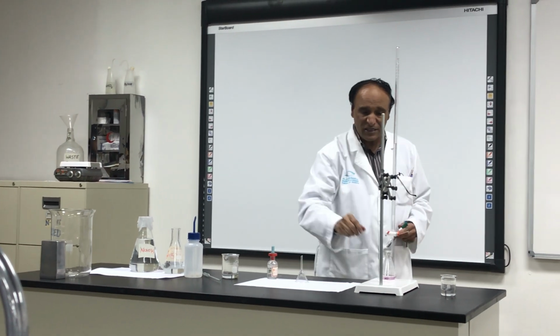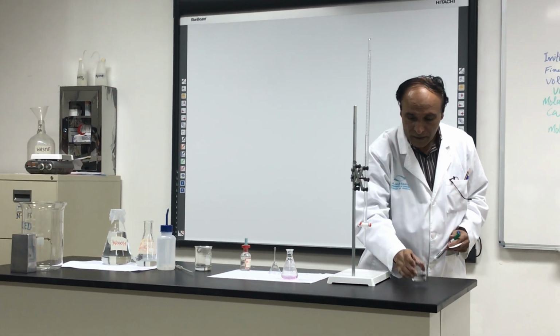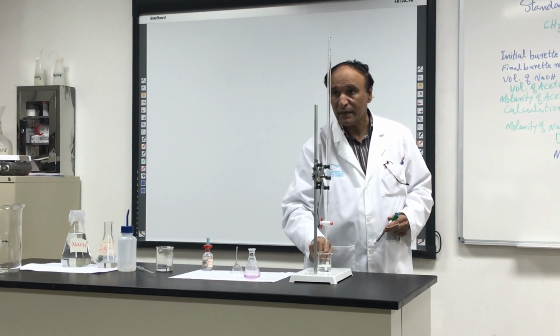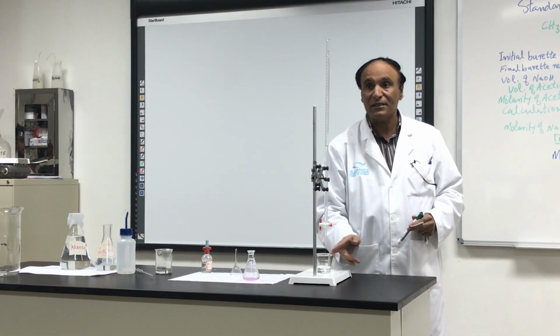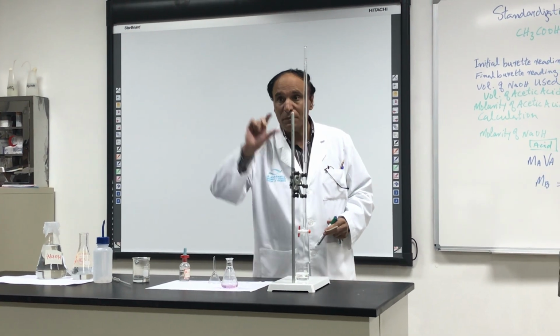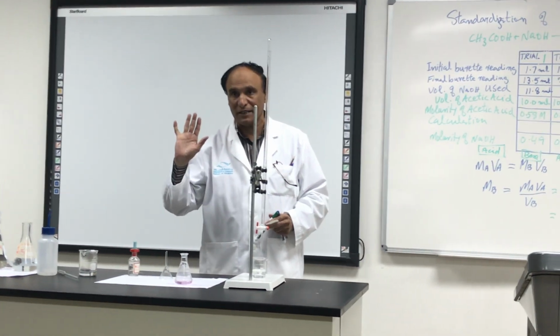Yes. When you finish the experiment, you will wash your things. You will put back the sodium hydroxide over here. This beaker, don't keep it separate. It has sodium hydroxide. Don't mix it with other things. The small beaker has sodium hydroxide. It should not be mixed with the other.